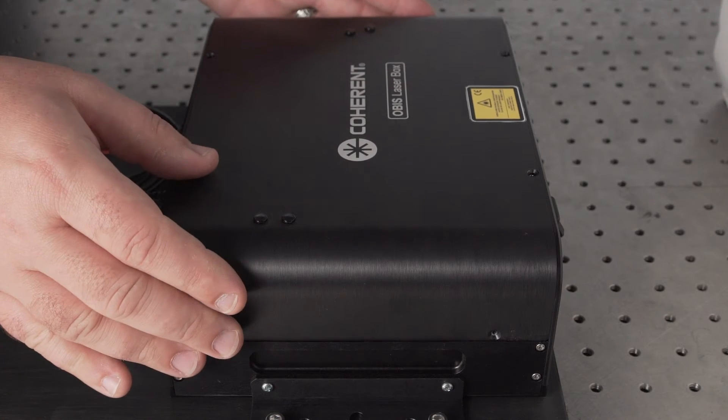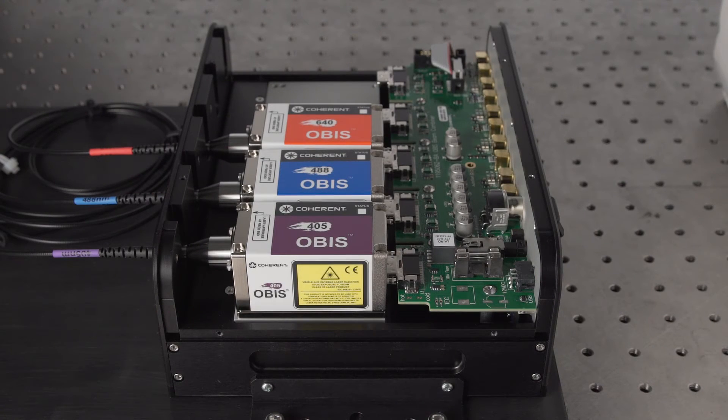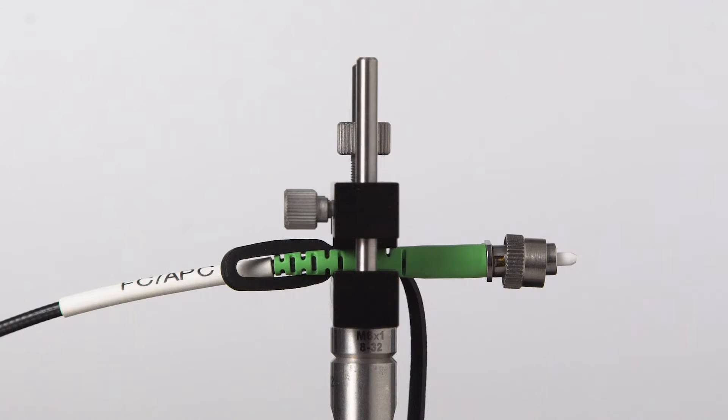The system comes pre-installed with three OBIS fiber coupled lasers with wavelengths of 405 nanometers, 488 nanometers, and 640 nanometers. Each fiber comes with a proprietary tip making it possible for high coupling efficiency with an average of 60 percent or greater power throughput.